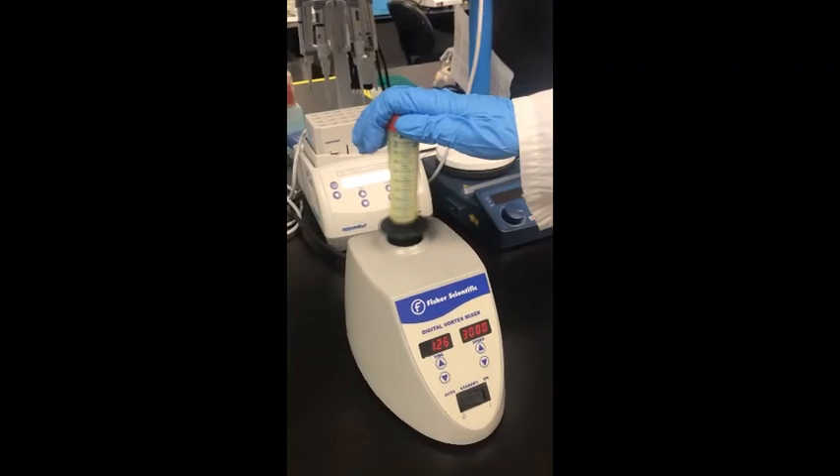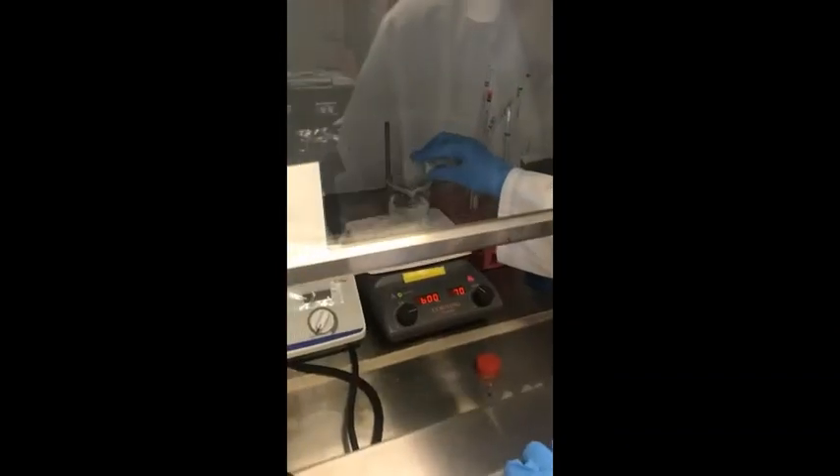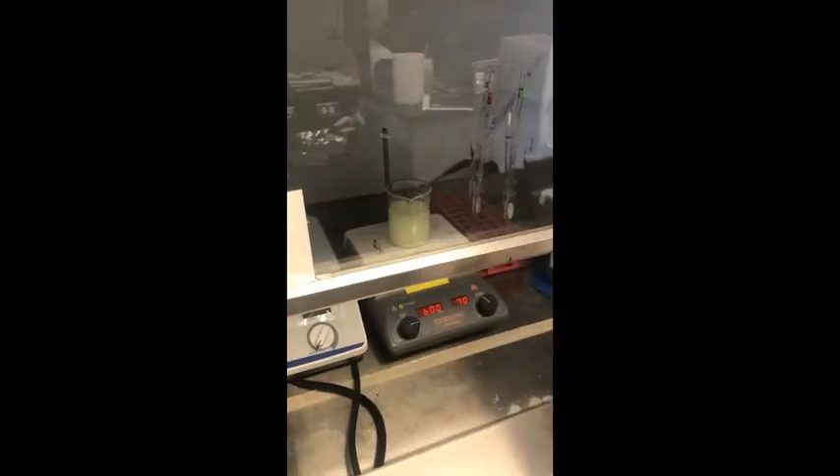Stir for 10-20 seconds using the Vortex. Bring the stir bar up to 600 RPM in the water bath and then transfer the emulsion to the water bath very quickly, pouring into the side of the Vortex.